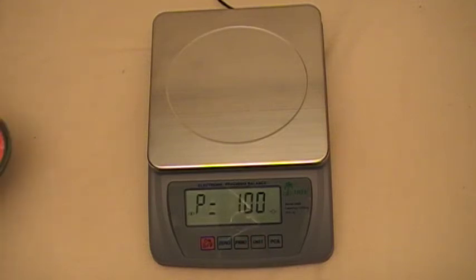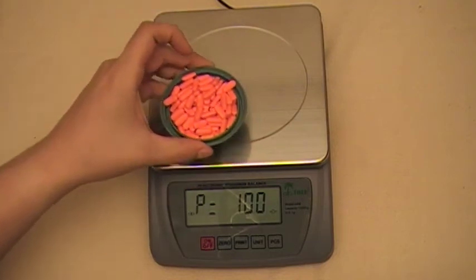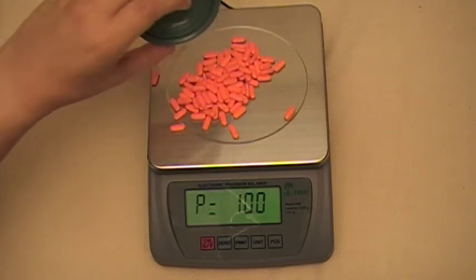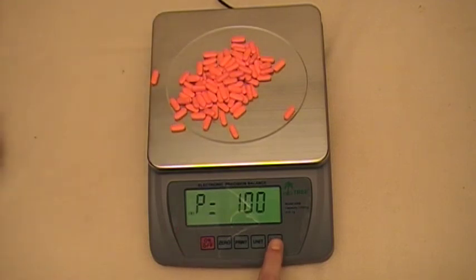I already counted out exactly 100 ibuprofen pills. I'm going to put those on the scale. Wait for the stable indicator to come on. Then press the pieces key again, and now the scale has averaged those at 100 pieces.